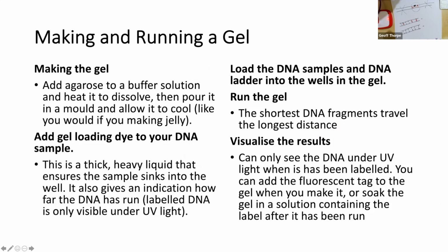Yeah, so we'll run the gel, and as we know, the shortest DNA fragments will travel the longest distance. Then at the end, we want to visualize the results. As I said, we can only actually see the bands when we look at it under UV light, because we need to add a fluorescent label.